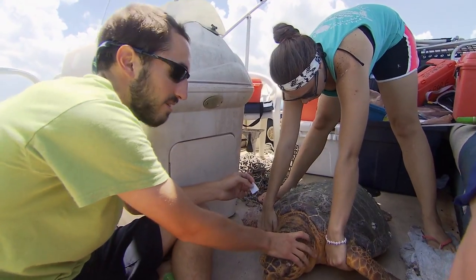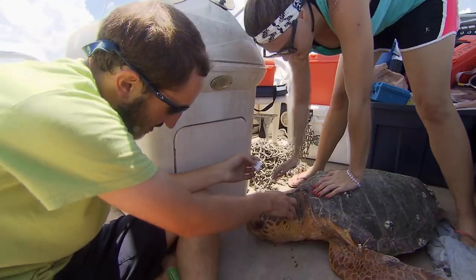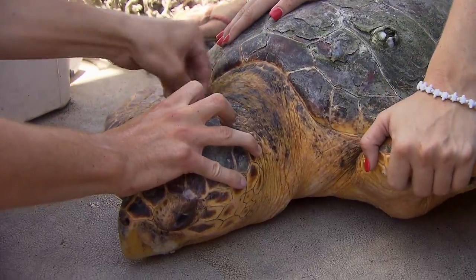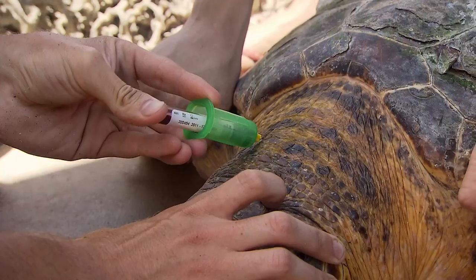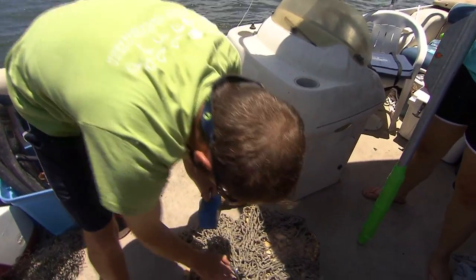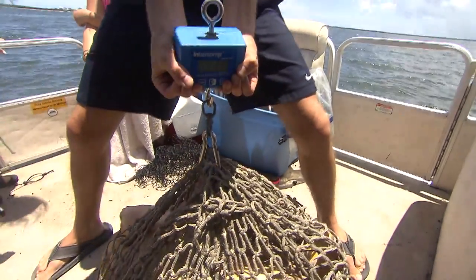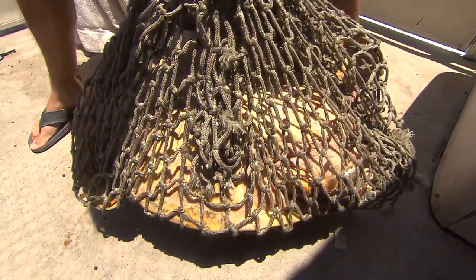Right now I'm going to swab the area right around the dorsal cervical sinus if she would cooperate. It's 35.1 kilograms.